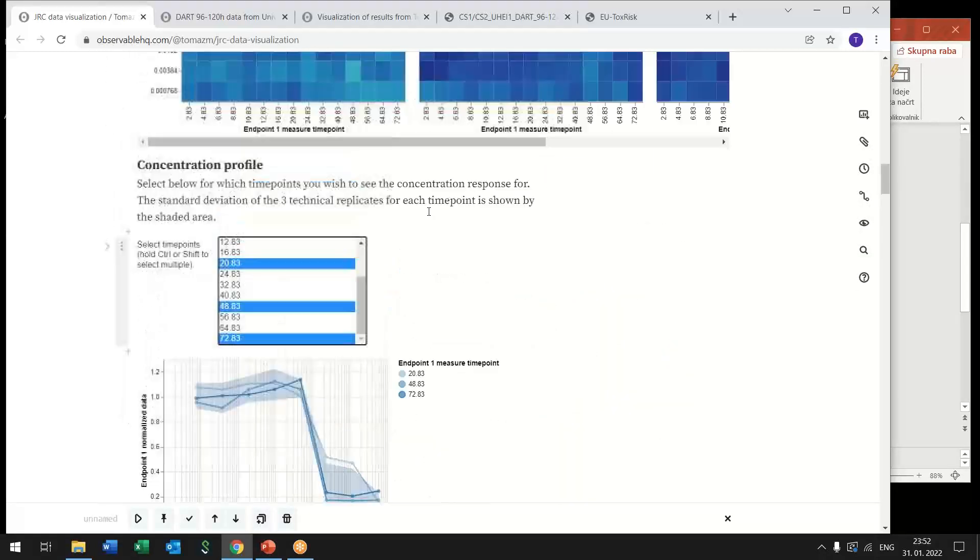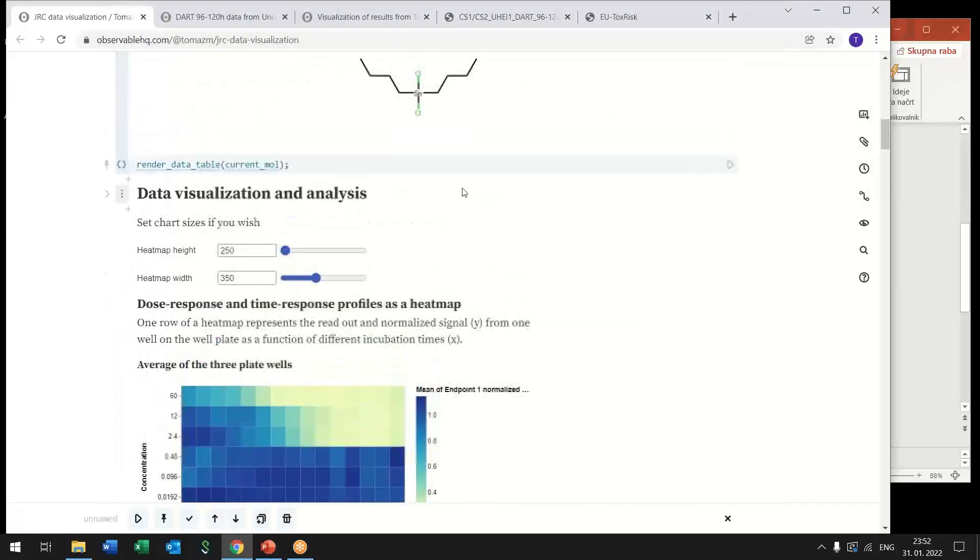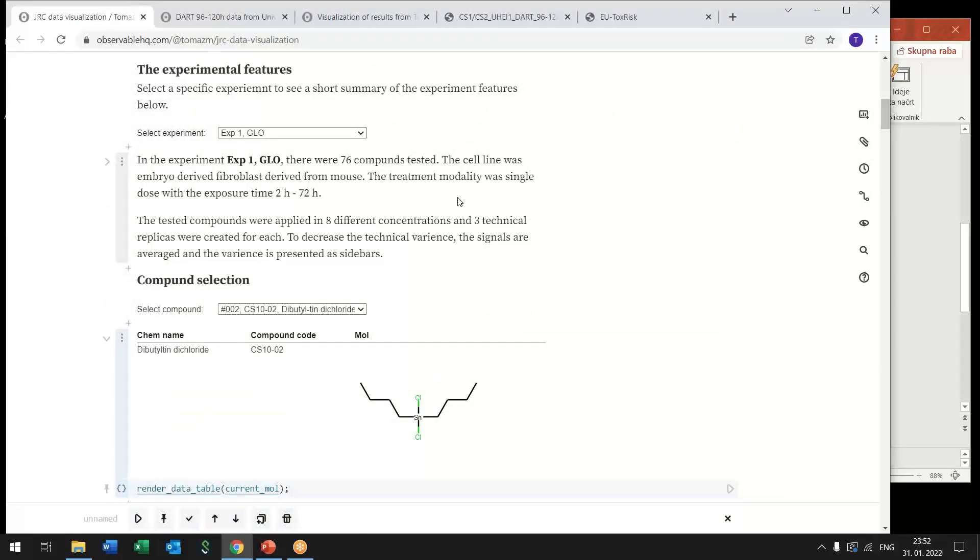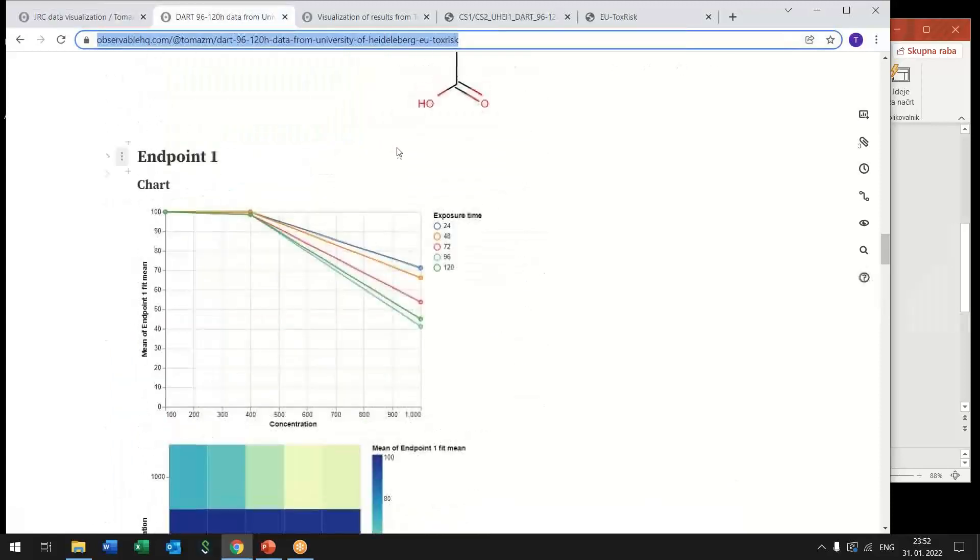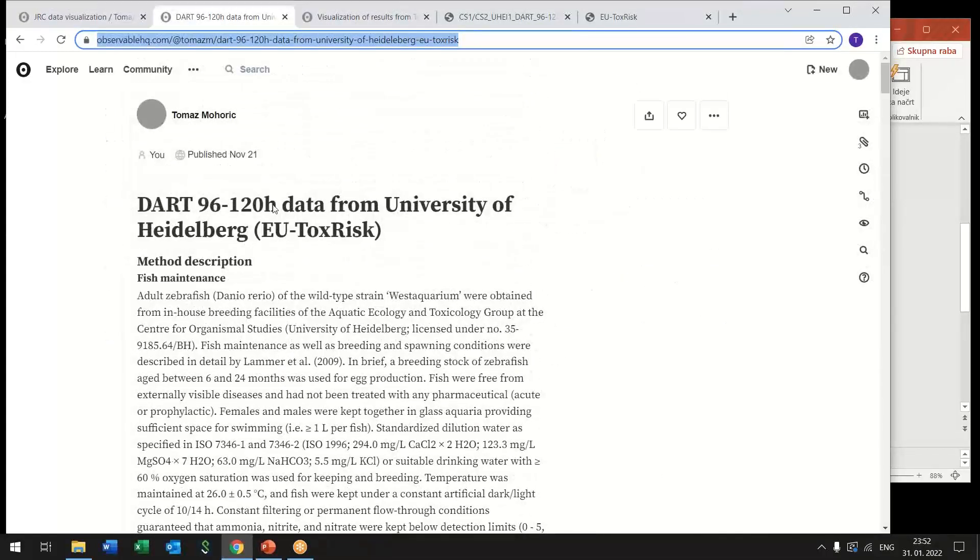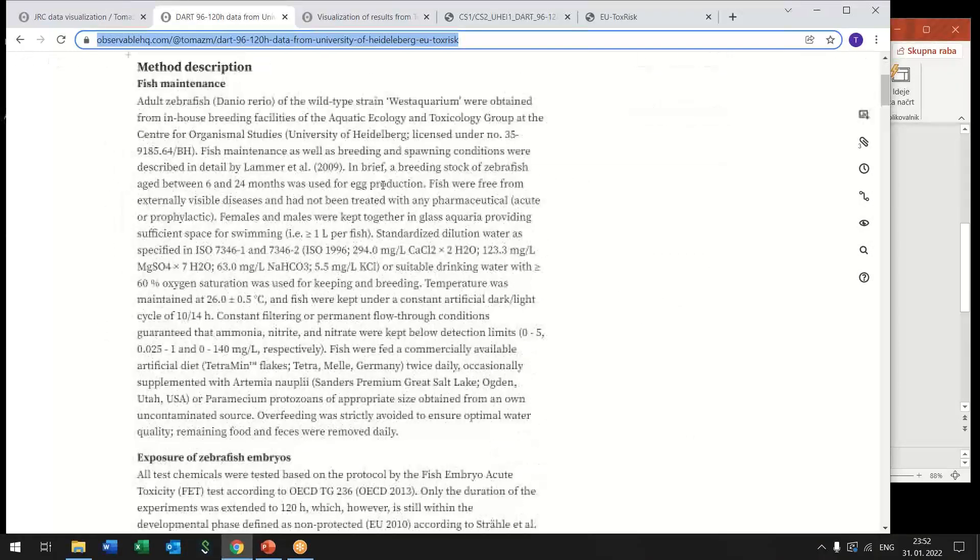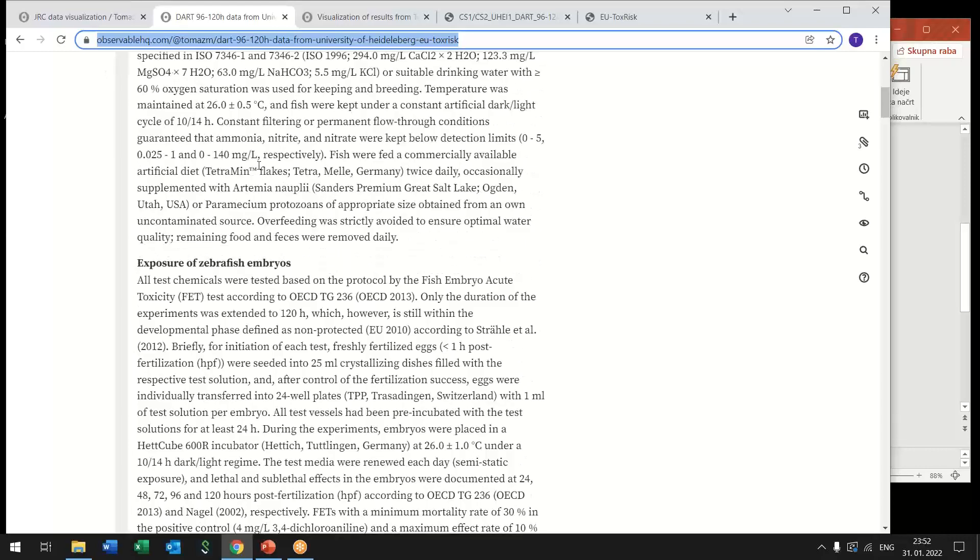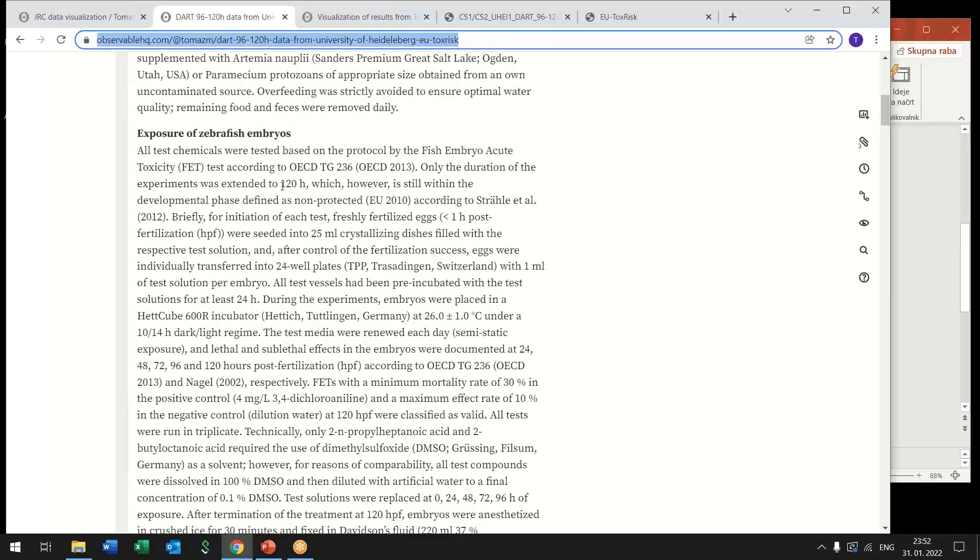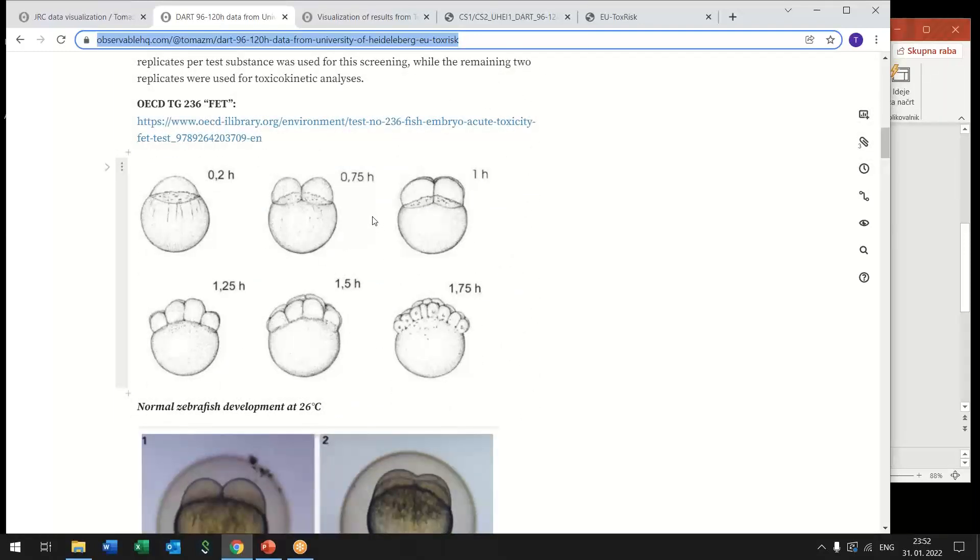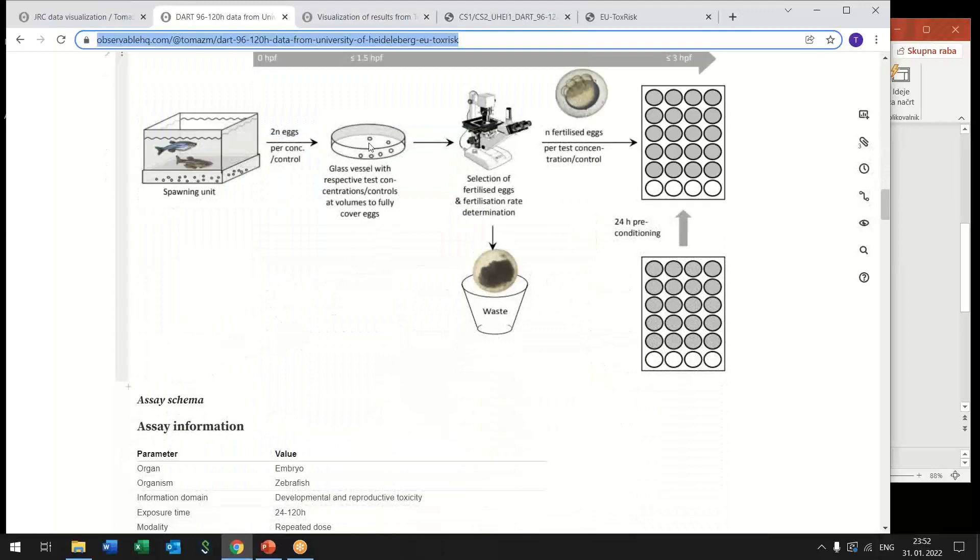So this is one relatively simple example that shows already the power of having a good database that can serve you data as a web request through web service. Another example is coming from the university of Heidelberg where developmental toxicity assays were performed. Here again the notebook begins with the introduction and description of the method also with some images from this assay and schematic representation.